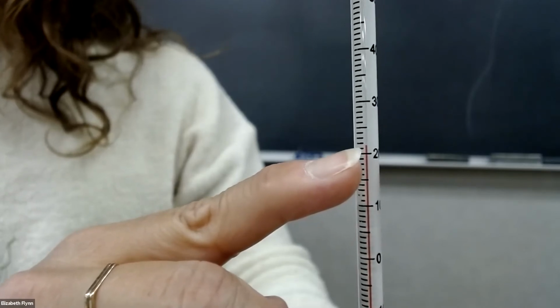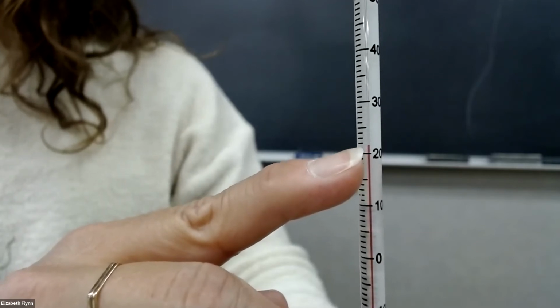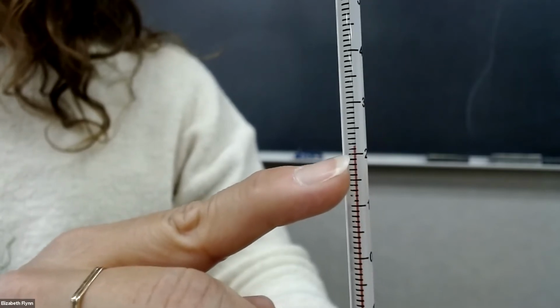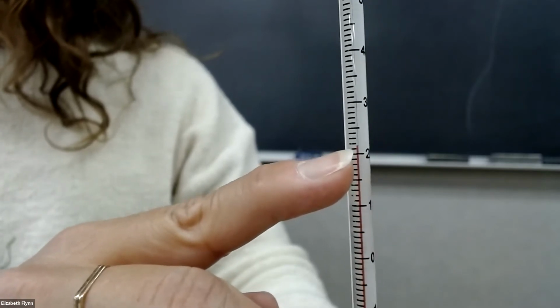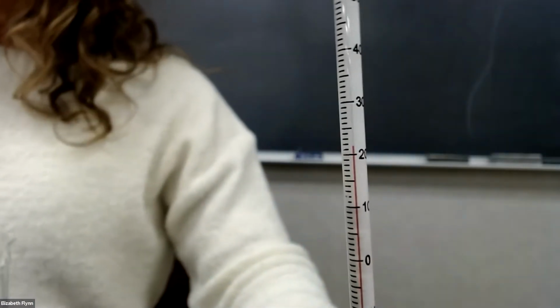Sure. I would say like 21.7, right? And it's actually heating up a little bit as I'm holding it on the bottom there. So yeah, about 21.7 degrees Celsius. And that's what we'll write down.